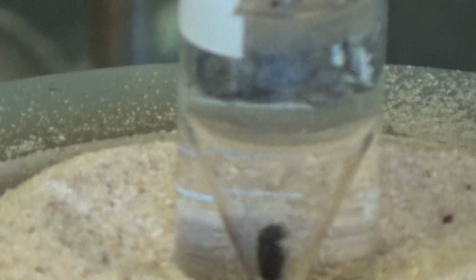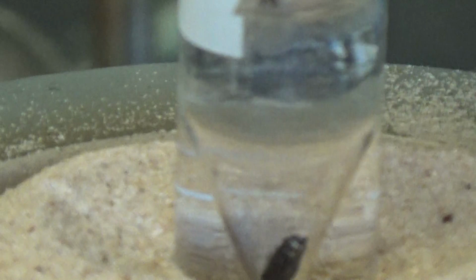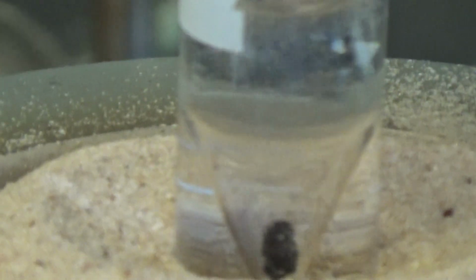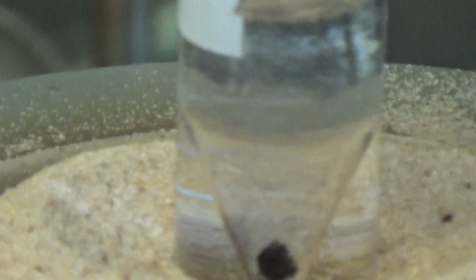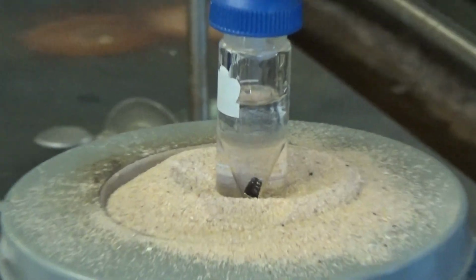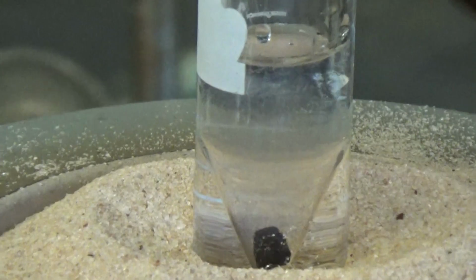I might try to touch it again. No. Okay. I think you need your fingers. You don't want to leave your student alone. After this one, you just have one experiment. Sweet. All right, reaction's going. It's boiling. It's pretty cool to watch. The nice part will be the mechanism. Yeah, the mechanism. I will speak about that on the board. It's a cool mechanism.